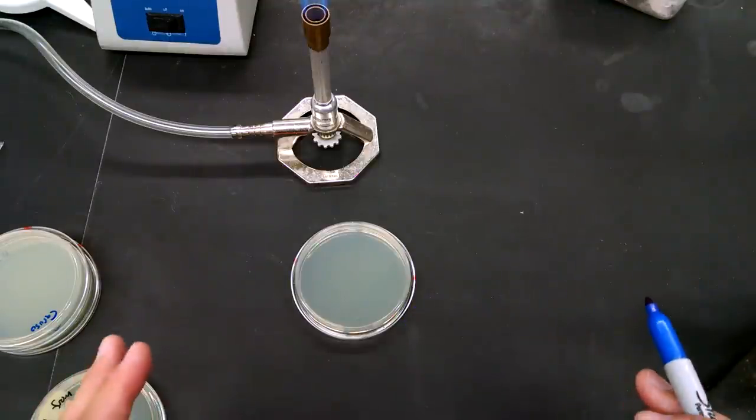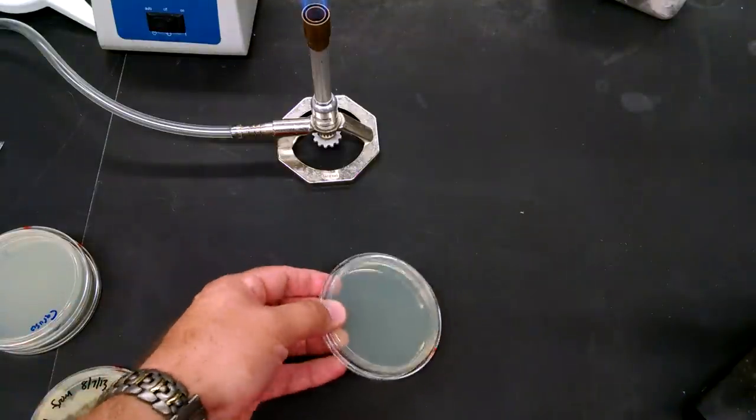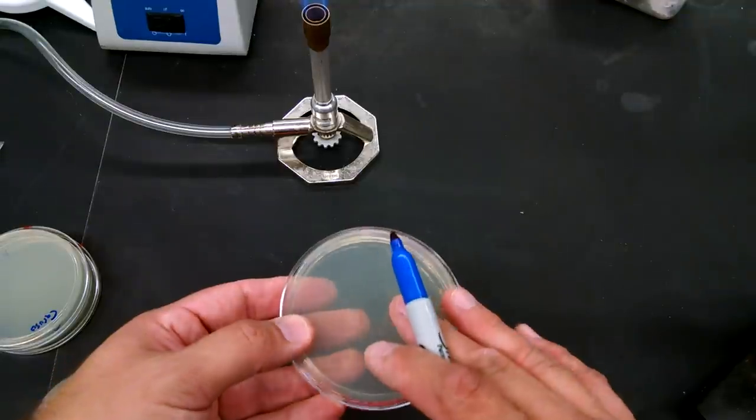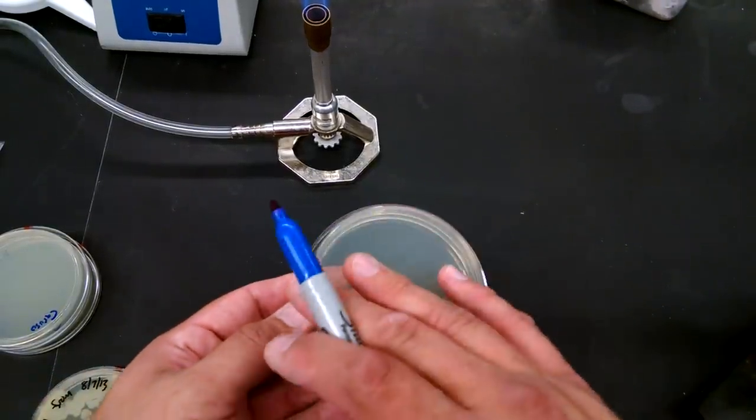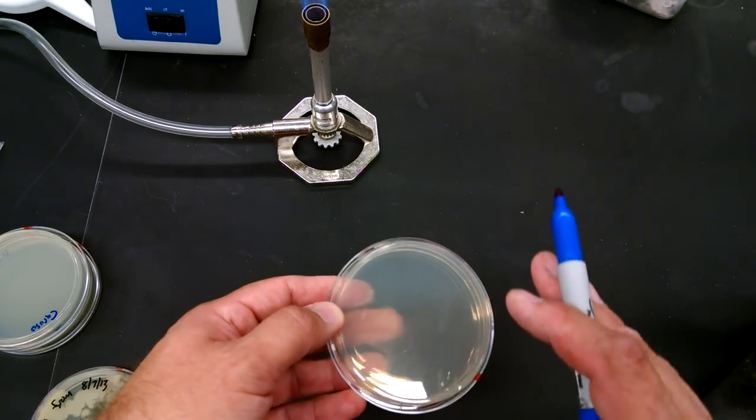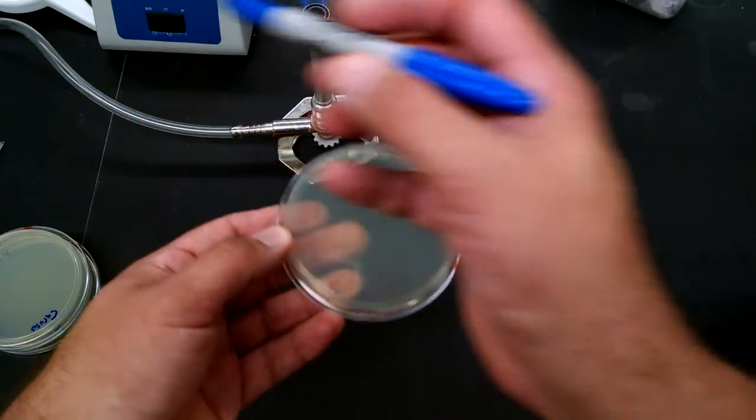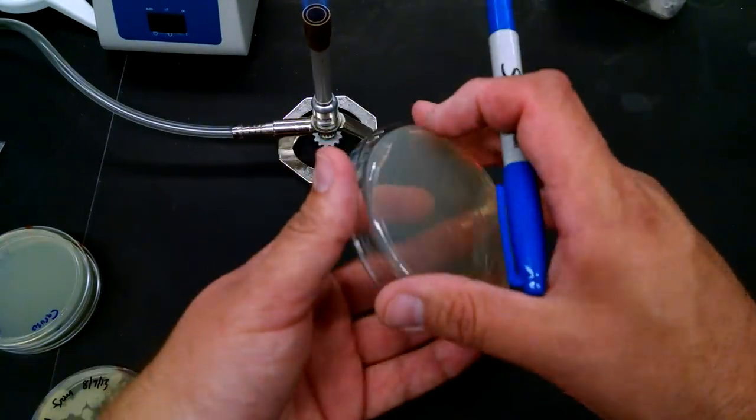Whether you're using a disposable loop or a flamed loop, what you're going to do is put some of your sample on the loop and then add it to the plate. The goal is to spread it out on the plate. What you're doing is a dilution on the plate. You're going to take some of your sample on the loop and spread it out. We're doing this inside the plate, of course.